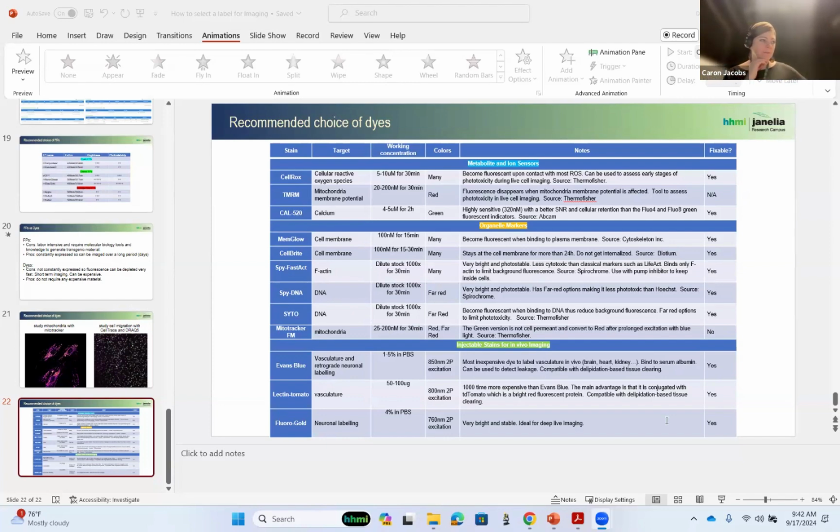Along similar lines, something that I think is interesting that we see is people returning to revisit some of the older dyes that we've never really thought of specifically. I'm sorry, I was multitasking a bit. I don't know if you mentioned this in your presentation, but things like Nile Red as a generic non-specific dye. The nice thing about those is that because they're older, they're generally more cost effective, right? Yes. So that's something that I think would be interesting to, in a systematic way, maybe revisit and work out where the utility of those sorts of dyes would be.